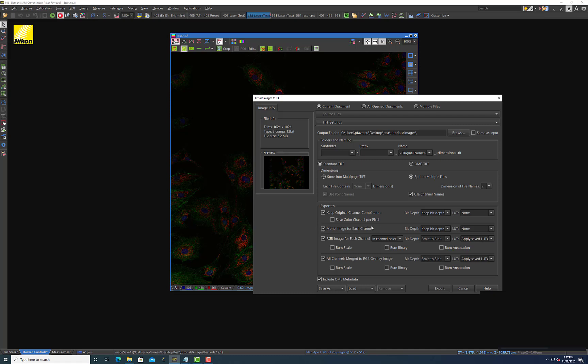In my experience with microscopy data, I always work with mono images where I keep the bit depth and I don't apply any lookup tables. So for best practices for microscopy images, I would make sure you always have this option checked because this will save all of your data as separate files that you can call on later without any image loss.